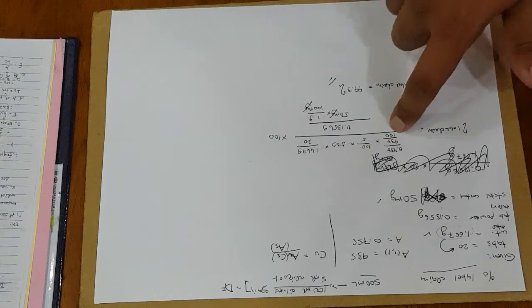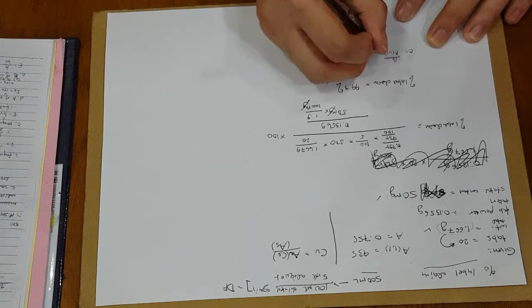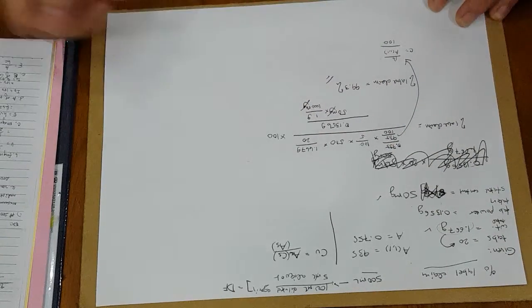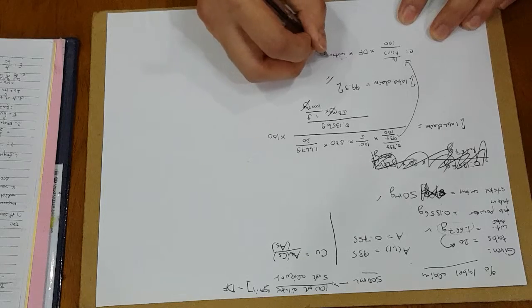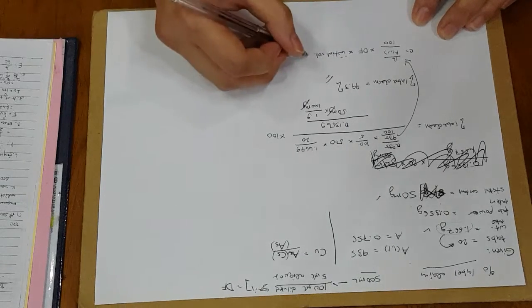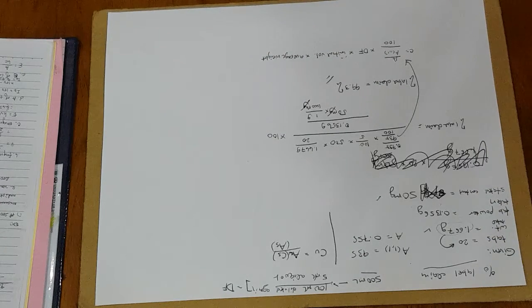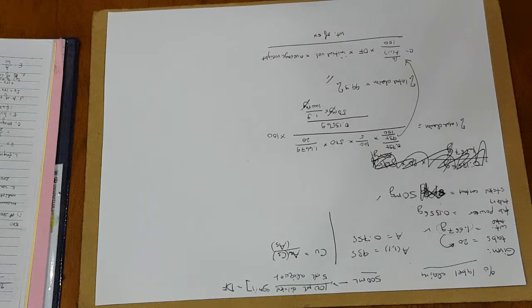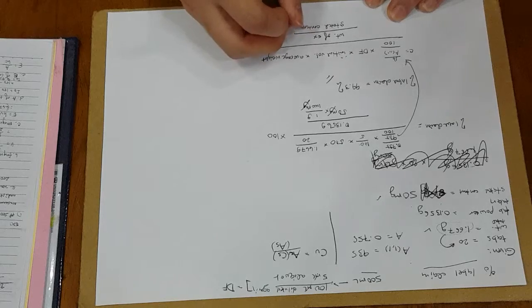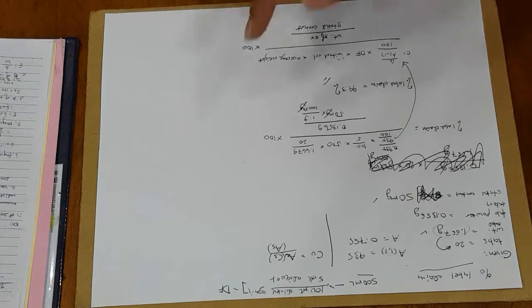So just don't forget this 100 here. We always have it. Can you write the formula here, Mr. Lee? It's again your A11 value, and then you multiply it with your dilution factor. So basically it's your aliquot in the denominator, your final volume in the numerator, and then multiply it by your initial volume. It's the final volume of the initial dilution, so we just call it initial volume. And then by the average weight of the tablets, in this case 20. And then we divide all of these by the weight of the powder you took in the numerator, divided by the labeled amount, or the stated content as in the problem, and eventually just multiply by 100 since we're getting percent, and the answer you'll get is 99.3.